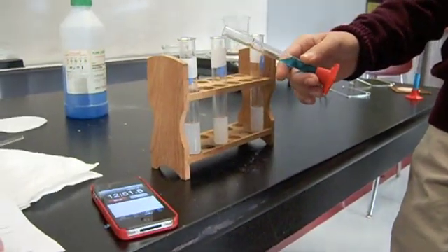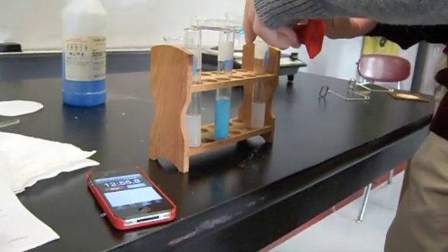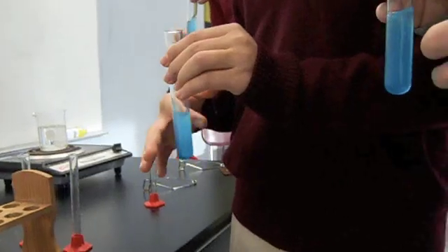Add five milliliters of Benedict solution to each tube and thump to mix. Place the tubes in a hot water bath. The reaction takes several minutes to begin.